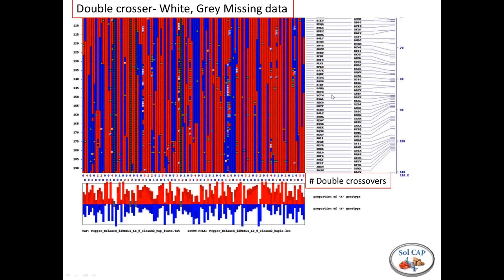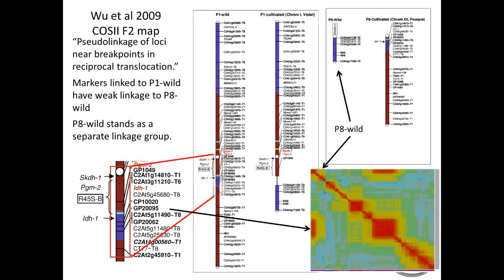If you go across, these markers actually represent areas of low linkage, and sometimes you may have double crossovers in the order here, but you may not have the resolution to make that call in the first place. You have to balance that, as a scientist, to say: are these really a problem, or are these areas where the markers are so tightly linked that we really are not sure what that order is? So I'll give you an example of how we've used that tool in Pepper.